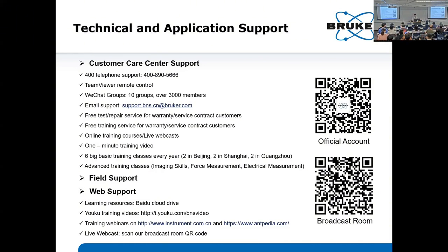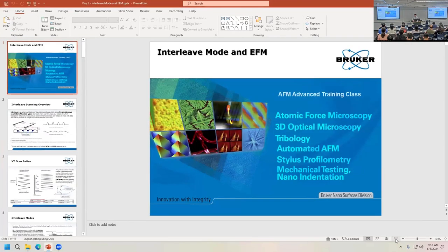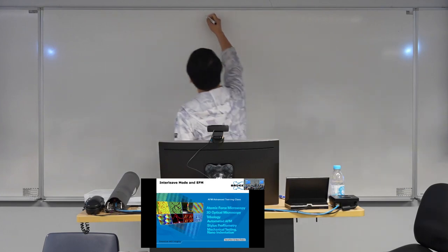Let's go directly to our topic today. Our topic today is about the so-called electric field force microscopy, one classic application of the AFM. That's the so-called EFM. Before that, I would like to give a brief review about the AFM for you again.